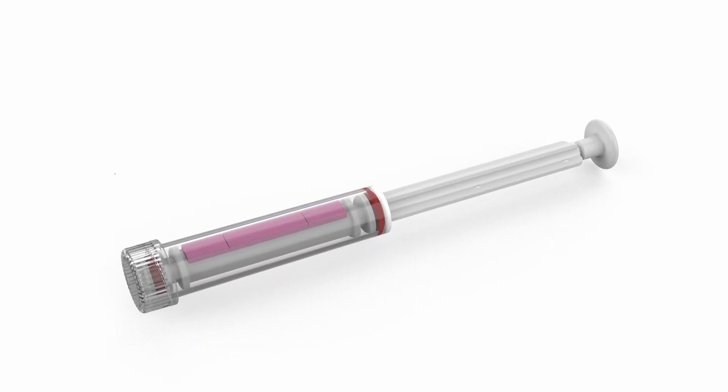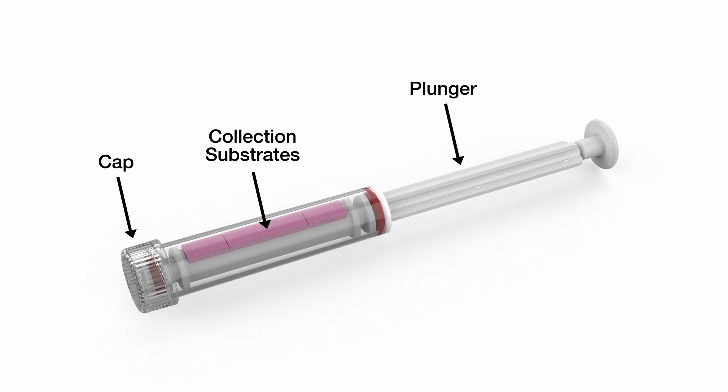The sample cartridge consists of a cap that twists on and off, a collection substrate isolated inside the sample cartridge, and a plunger.